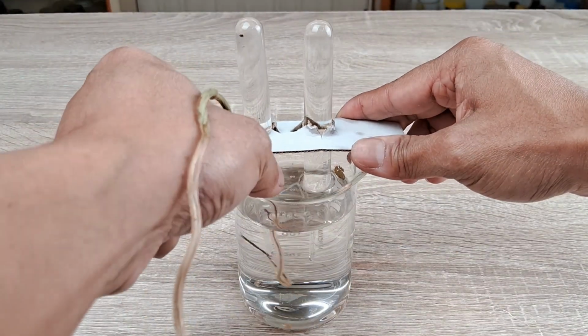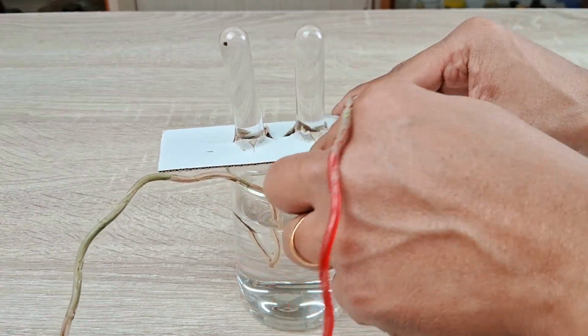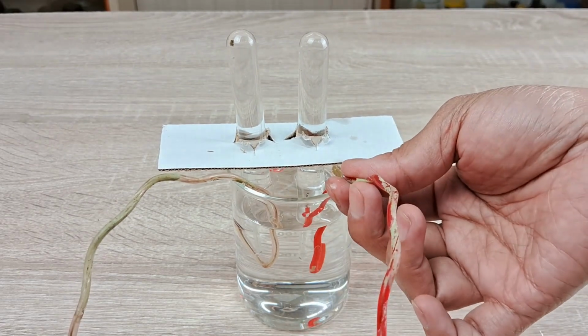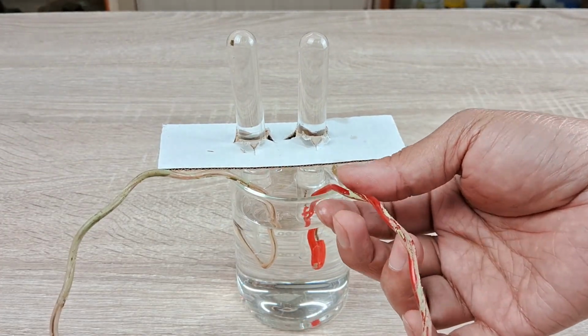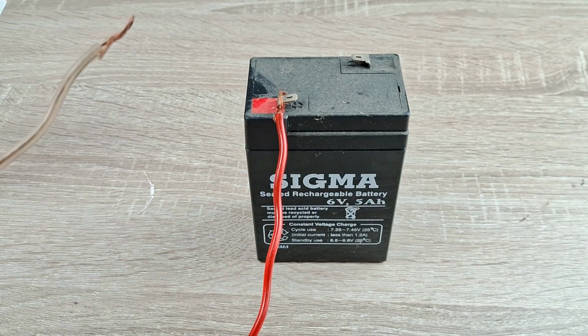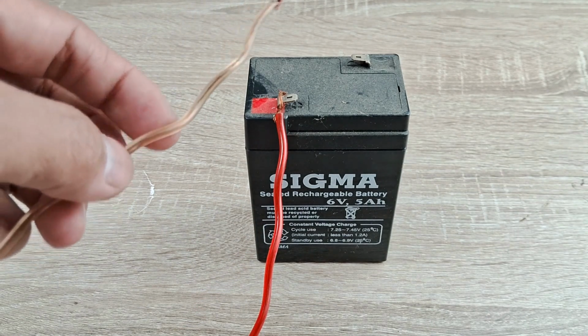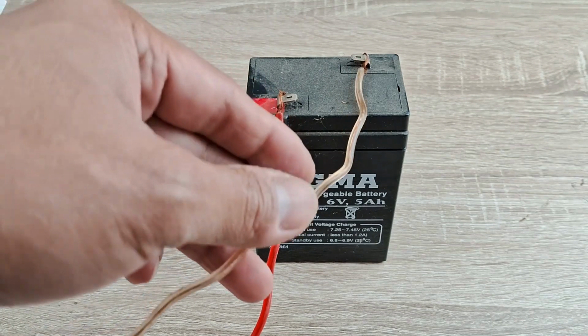Next, take the 2 insulated copper wires and introduce their exposed ends into the mouths of the 2 test tubes like so. Connect the other ends of the 2 wires to a 6-volt battery unit. Allow the experiment to run for some time while observing the test tubes closely at intervals.